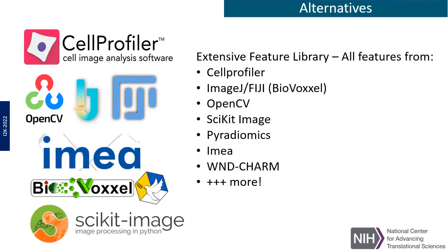There are many great alternative pieces of software, but they are not sufficient for us, for the HCA. No instrument meets all the requirements at the same time: speed, out-of-core processing scalability on large images, a minimum set of comprehensive features, availability as a user interface, Python library and command line interface, whole slide analysis mode, neighbor calculations, hierarchical relationships, usage of GPU, and more.